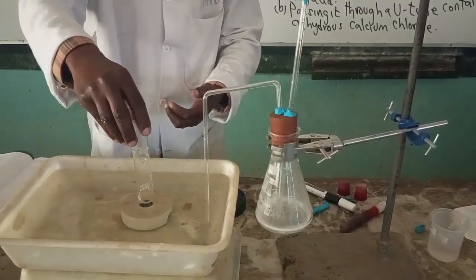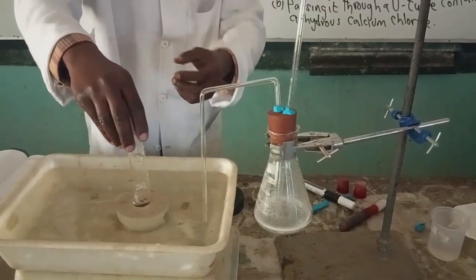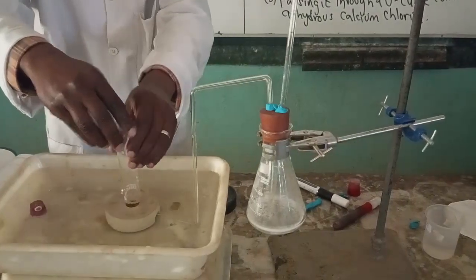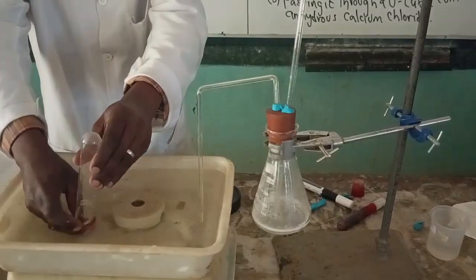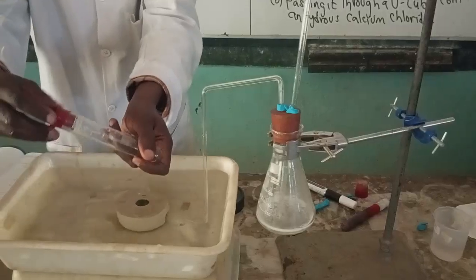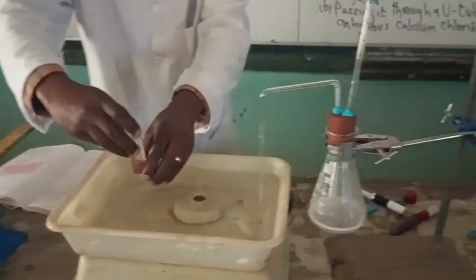So our second boiling tube is almost full. So I need to cork it. We may collect the last one.